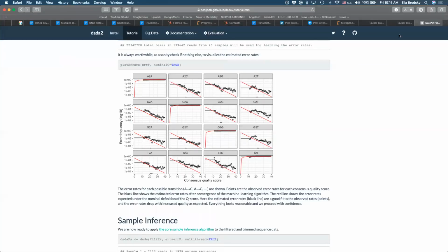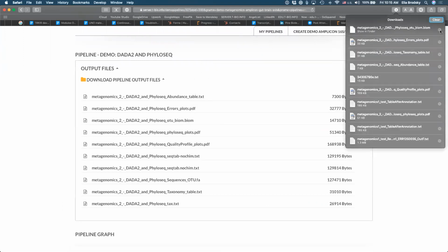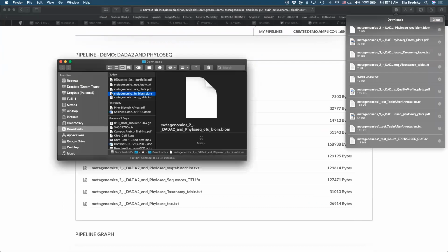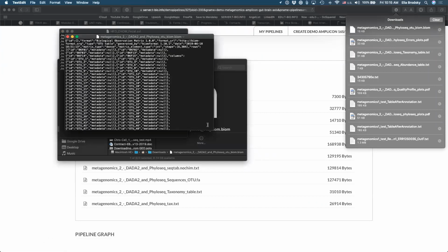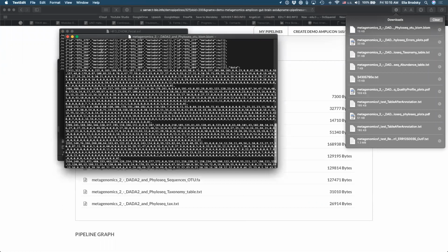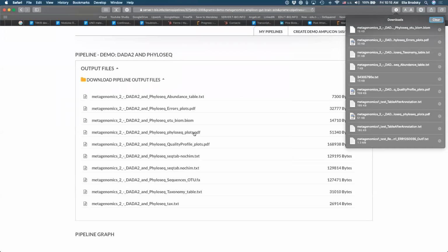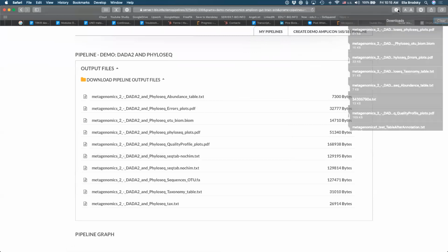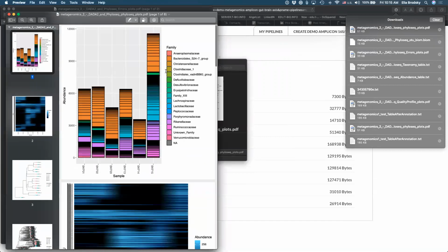Now let's go back into our pipeline and see what else we have. The next one is this file.biome. Okay, so let's open that. Here we essentially have what's called an annotation file that provides all of this information for visualization, because later on we can see what kind of plots we are actually generating. So the plots, let's take a look at the plots here.